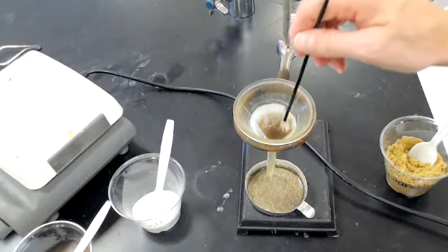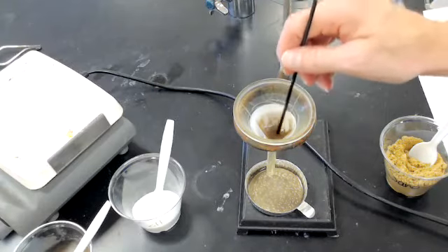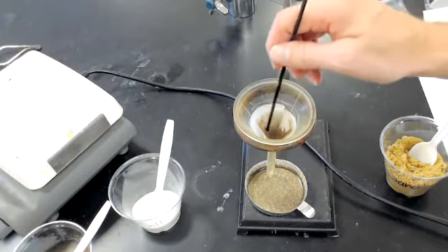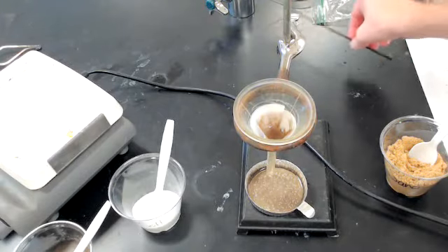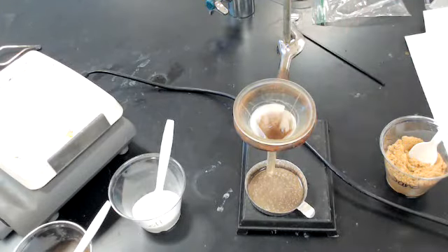Now remember, it's only the solid chunks that get caught in the filter. Anything dissolved is still going through the filter. Germs, bacteria, viruses, any solid that was dissolved is still going straight through. So it's not like you're ever going to be able to go camping and find a muddy puddle and put it through a filter and have safe drinking water. It is certainly not safe. It'll be cleaner from dirty looking stuff, but it will not be safe for drinking.